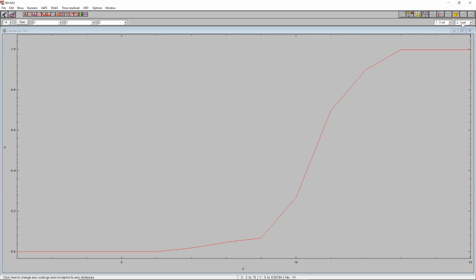This is in the first or in the second column. This is the first thing that you load or that is displayed when opening this file. So if you wanted to see the next concentration, this is for the fourth column now. The third column would contain the E0 value, which we're not interested in, so we open the fourth column now.